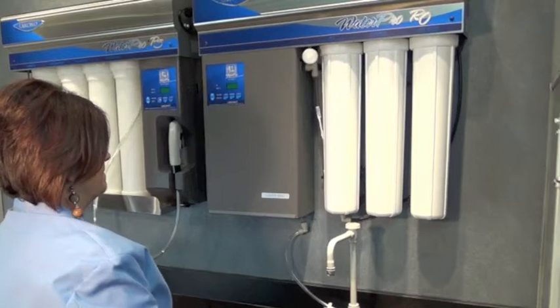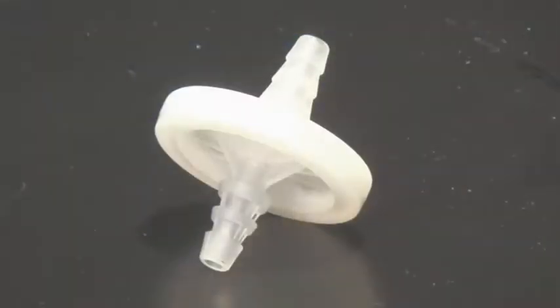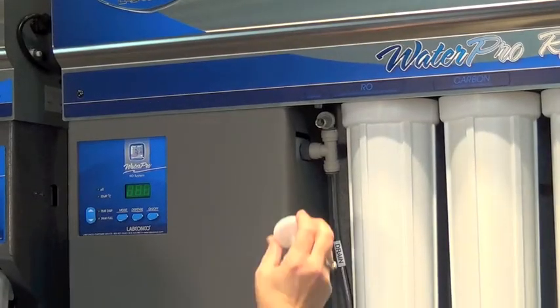To replace the storage tank's air vent filter each year, remove and discard the old filter and press a new filter into the tubing.